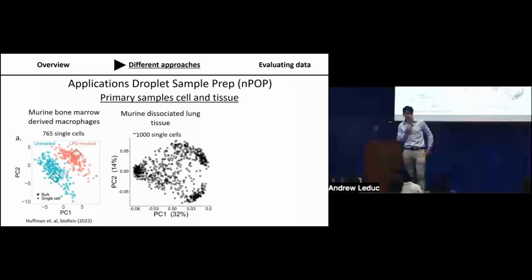Yeah. So one of the really nice things about doing proteomics as opposed to RNA sequencing is, for cells to be able to synthesize or degrade proteins, ultimately this requires energy. So to this extent, in our experience, we see less batch effects depending on how we prepare these samples.